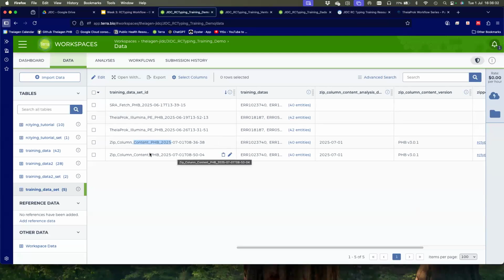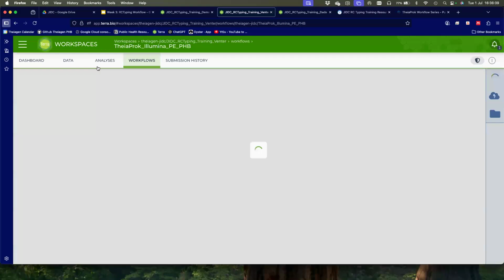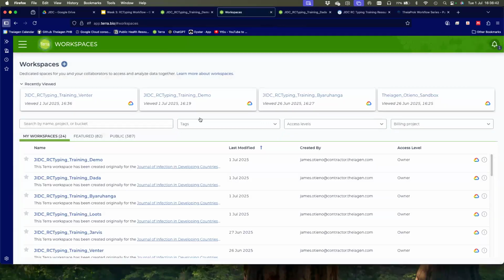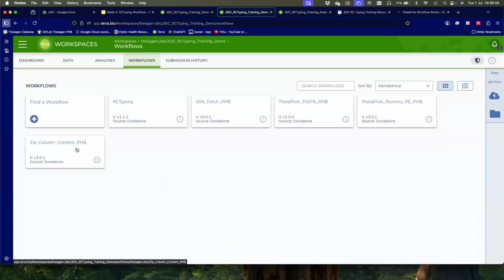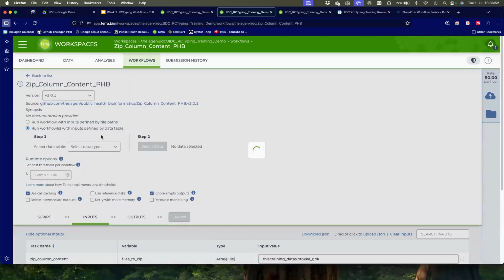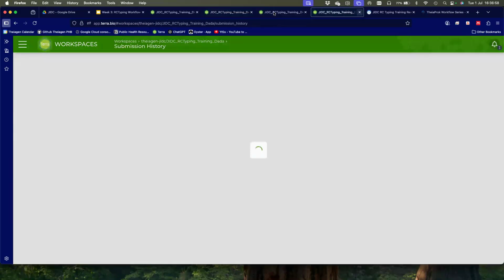Actually, let me give an example before we actually undertake this. So let me open this as well.